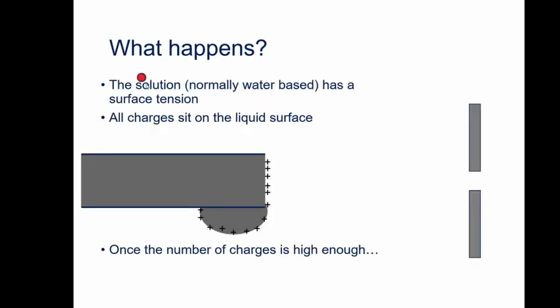So in here, let's have a look at the process of what's actually happening. So this is the needle that we apply the voltage to, and because the liquid is a conductor, Faraday's law applies, so there are no charges inside the conductor, the charges will all exist on the surface. I'm not showing the charging on the surface of the needle, although it will also be there. Don't touch the electrospray needle when it's on, although all proper mass spectroscopists should have done that once at least, by accident, not deliberately. But I am showing you the charges on the surface of the liquid.